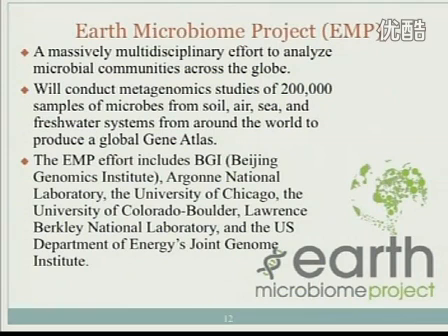But the general idea is that we can use degenerate primers that target those conserved regions of 16S RNA genes, so that hopefully you will be able to amplify gene fragments from all different 16S RNA genes from all different kinds of microbial organisms. So that's what we hope. But you should expect there will be some bias in the data sets you get.